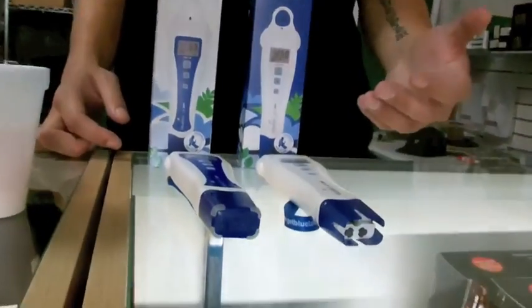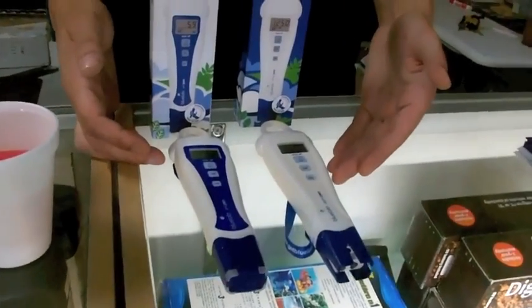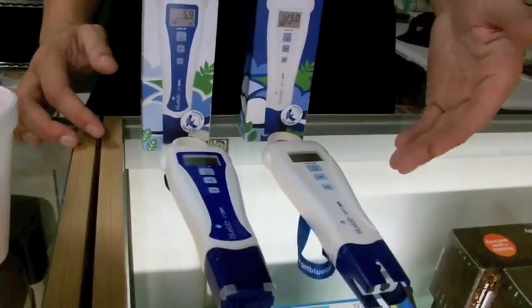Now these meters also have an auto-off feature, similar to the truncheon that Bluelab offers, so once you're done reading, you can just set it down. You don't have to worry about turning it off or anything — just keep your cap on, it's going to shut off, and be ready to go the next time you need to use it.